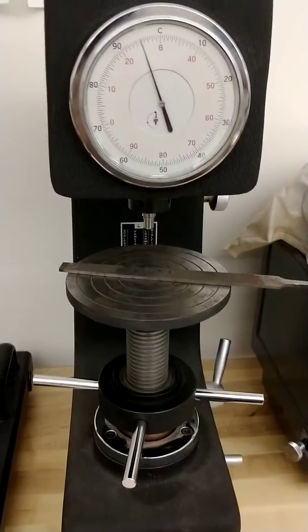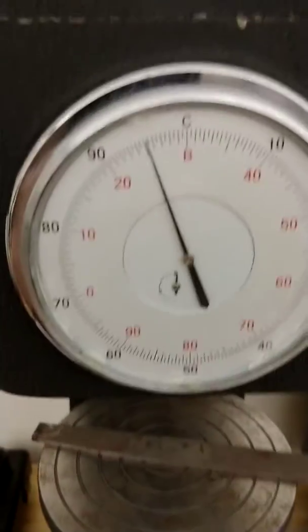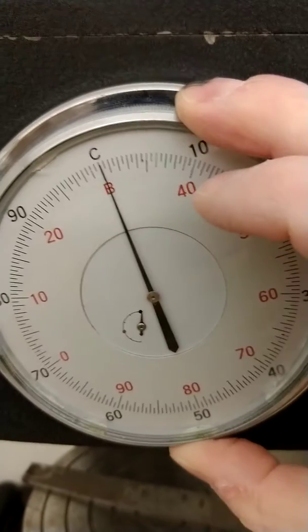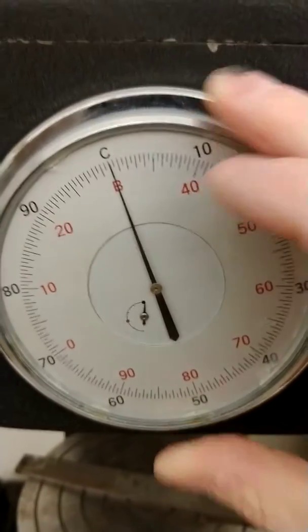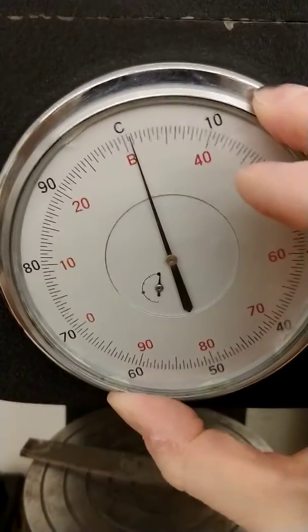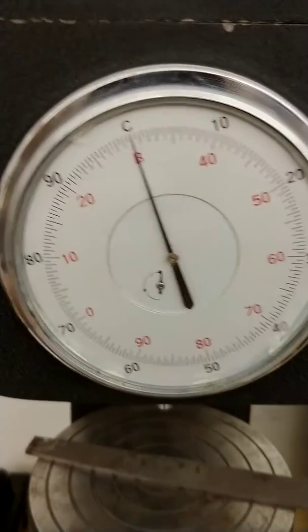We're going to try to take a hardness test on this file. The first thing we're going to do is go to the dial and turn the bezel — that's the outer ring — until the B and the C line up. It doesn't matter if the B and the C are straight up and down; the dial just moves to the indicator. So we're going to line those up. You always have to do that as the first step.